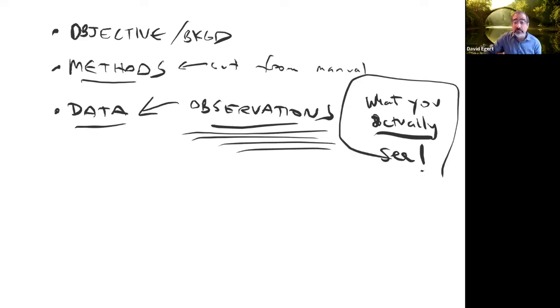For our lab today, you're going to watch Tina and me mixing things in different solutions, and we'll show you on the screen and describe them using words. In your lab notebook, you are going to write down in longhand, for this part or that part, what is happening and what the observations are. So this is minimal interpretation at this time. This is not about what it all means. This just means, what do I see?